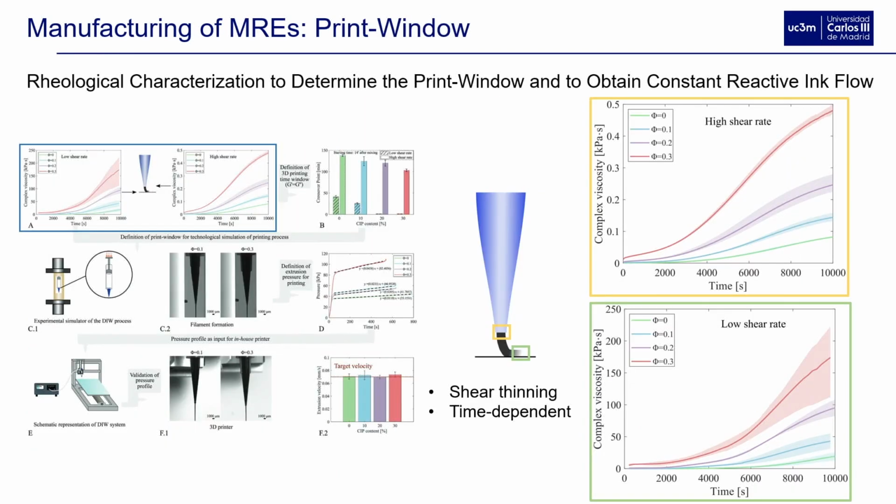So first we start with the rheological characterization to determine the print window. So in here we studied the viscous and elastic behavior of the material in two scenarios.